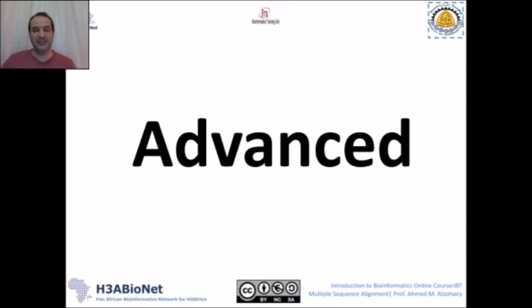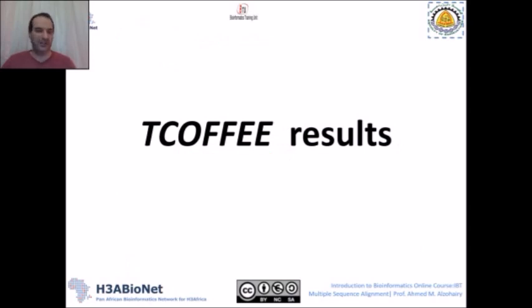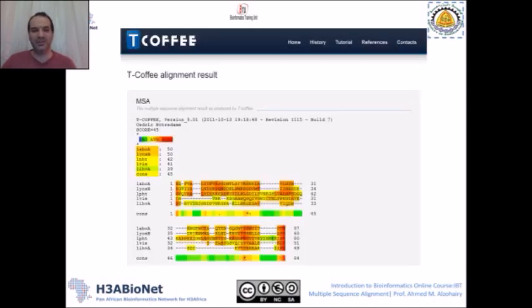Advanced. There are many advanced options, which you can change beyond this lecture. Simply, you get your result and see your alignment easily in a colorful way.